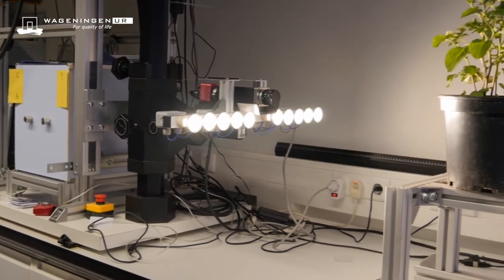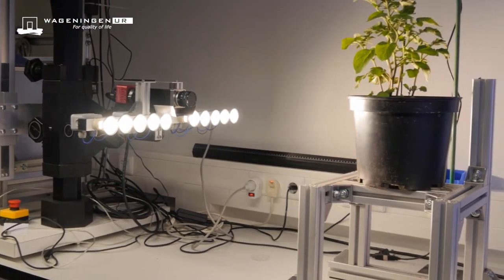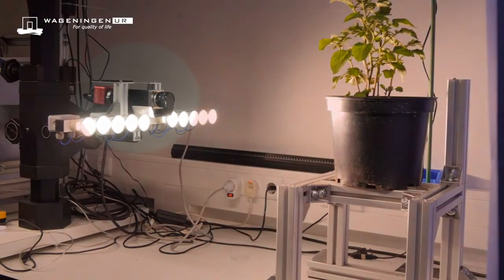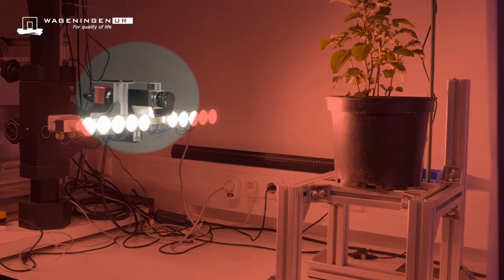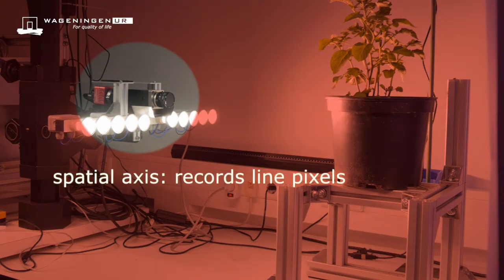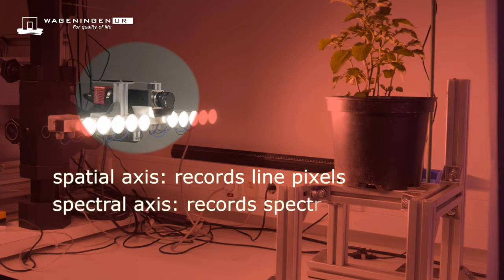The spectrographs are coupled to monochrome matrix cameras. One dimension of the camera, the spatial axis, records line pixels, and the other dimension, the spectral axis, records the spectral information for each pixel.